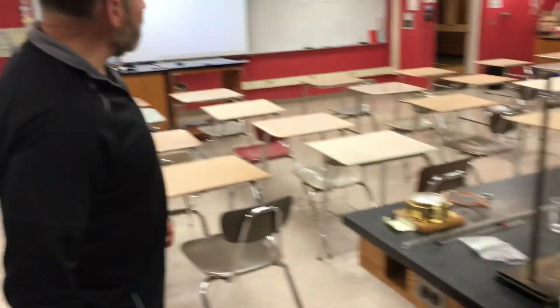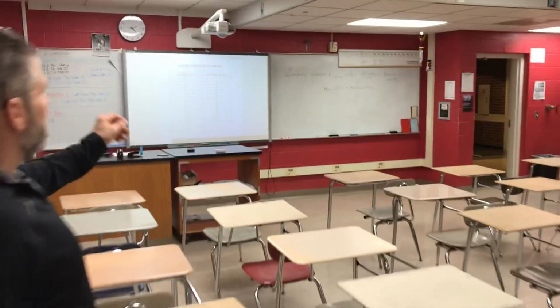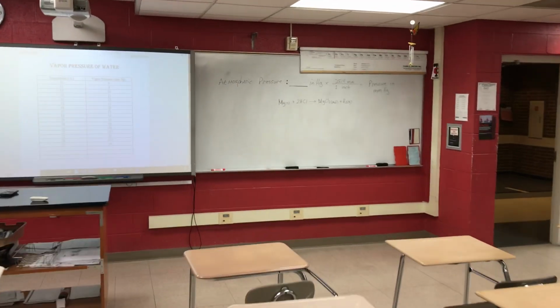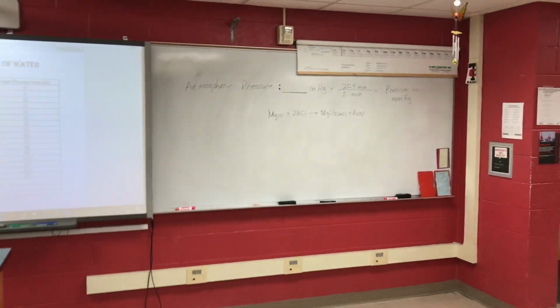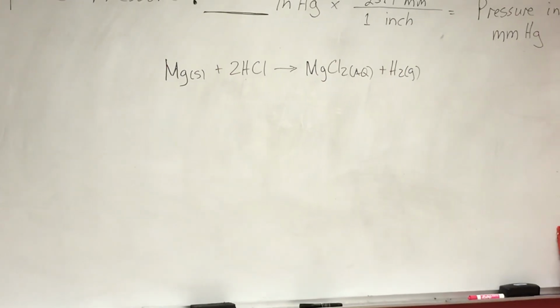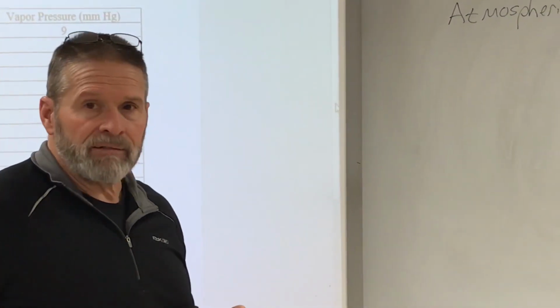The reaction we're using is up on the board here. We're going to react solid magnesium with some hydrochloric acid, and that will end up generating the hydrogen gas that we'll collect.